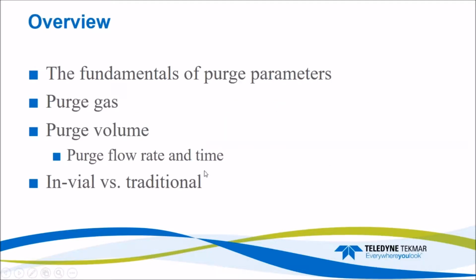All right, first we will discuss the fundamentals of purge and trap and purge parameters, and then purge gas selection with data from an alternative purge gas. And then I'll go into purge volume by flow rate and time with associated data. And then we'll wrap up with data from in-vial versus traditional purge techniques.